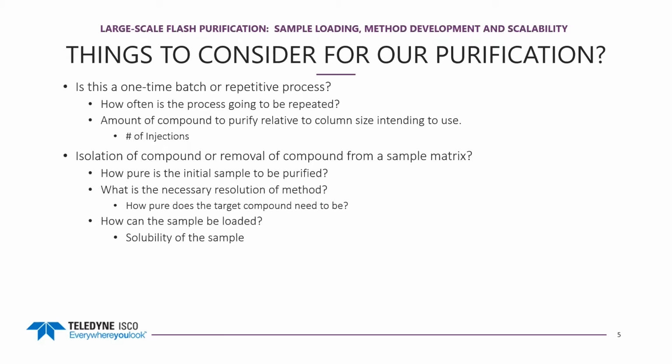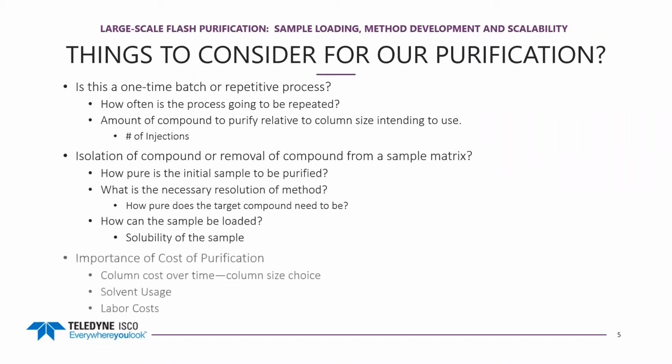The next question is, how can I load my sample? What's the solubility of the sample? Are we going to be doing a solid load cartridge, or are we going to be doing a liquid injection? Depending on your answer there, it's going to dictate what your options are for your process, and maybe what your purification and resolution outcomes could be.